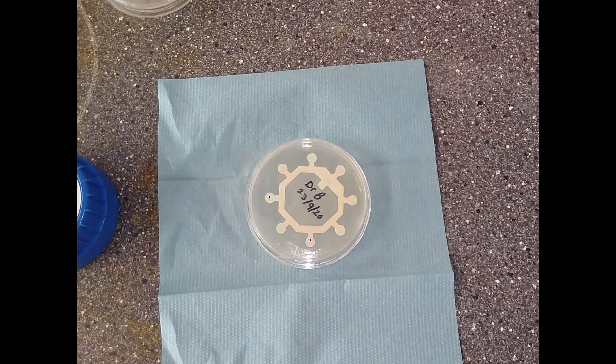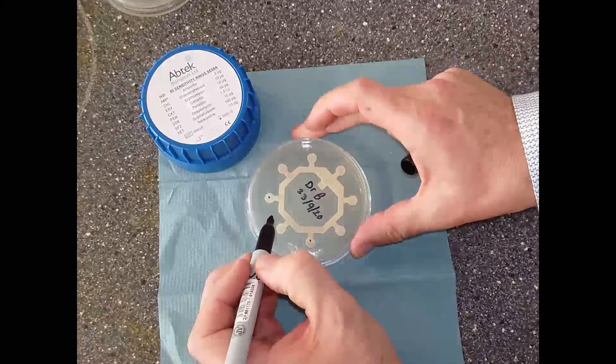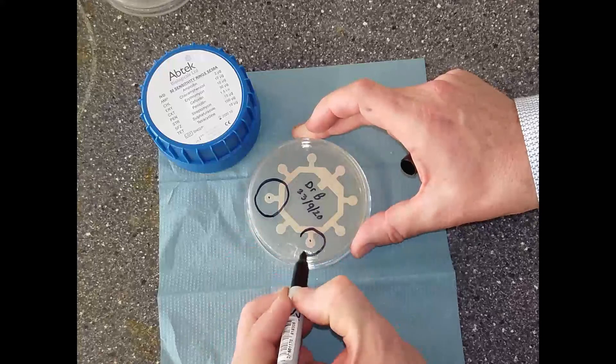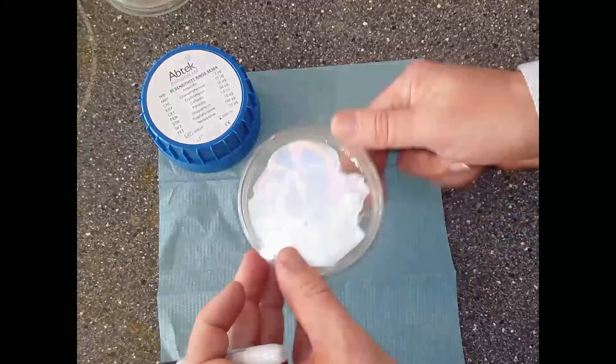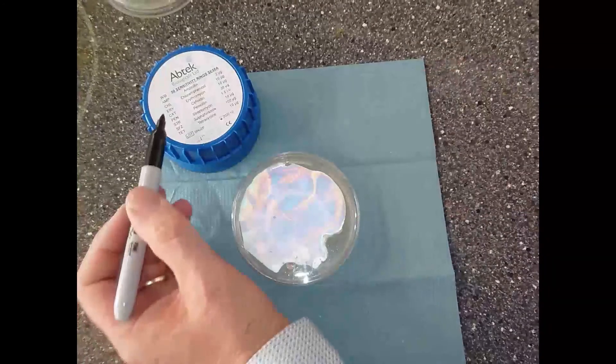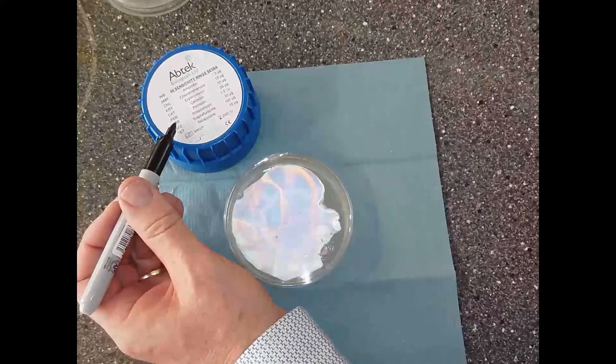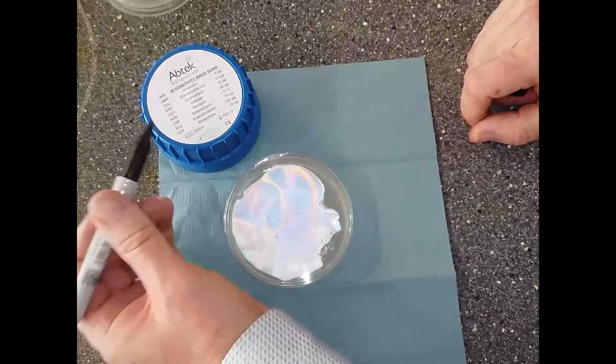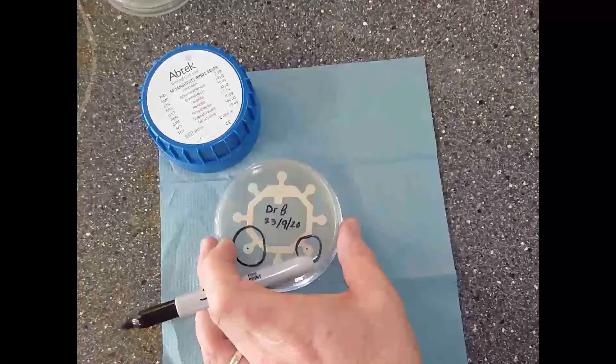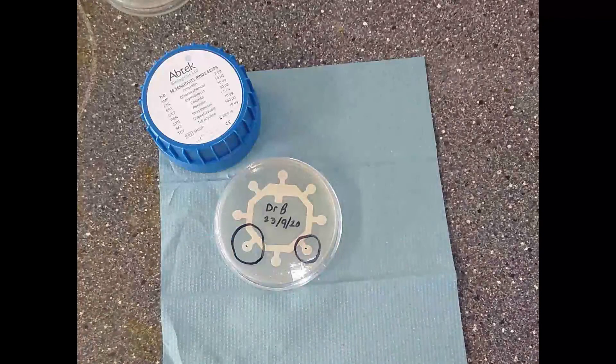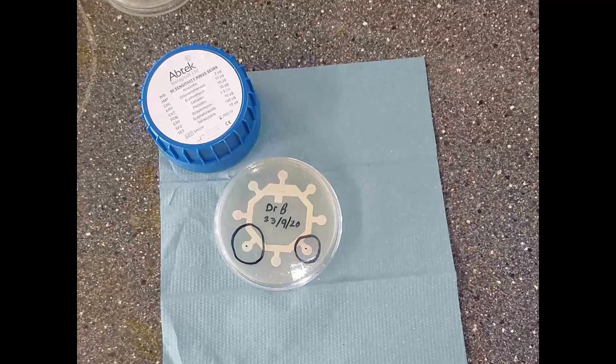The next thing was the sensitivity ring with the antibiotics. There were two that have been effective - this one here and this one here. As you can see, there are clear zones in those zones. The first one is CXB - that's cefuroxime at 30 micrograms. The second one is streptomycin at 10 micrograms - again, streptomycin, the one we had before. Can anyone think why it'd be really useful in a hospital situation to use these sensitivity rings when looking at a bacterial infection, say an unknown bacterial infection?